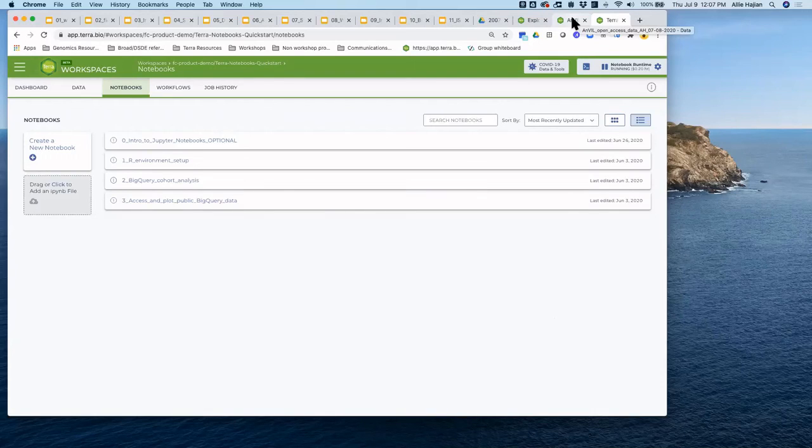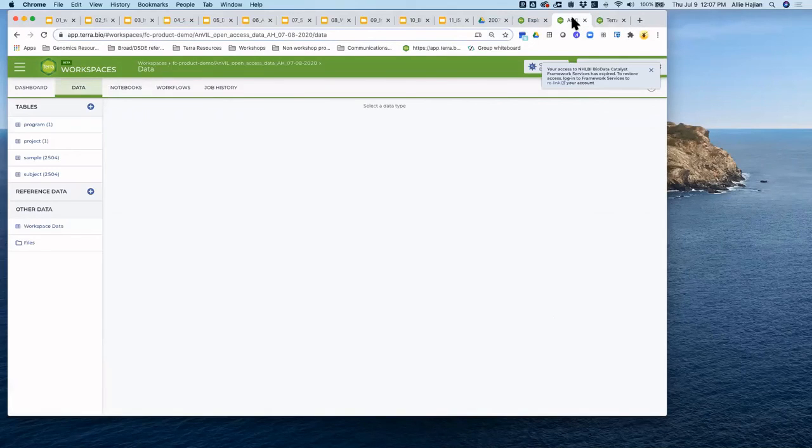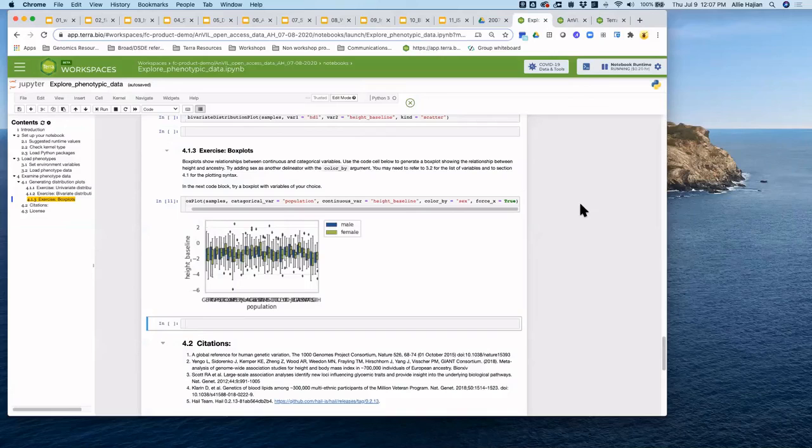Allie, just thinking about the notebook you just demoed, it did run the Terra Utils notebook at the same time as your other notebook was open. Oh, that's true. So perhaps if it's on the exact same runtime, if the notebooks have the same requirements, it's okay. If you had to run a Python notebook and then an R notebook that had 2 different environments, I'm not sure you could do that. I think you would get a warning about your runtime not being the appropriate one. You're right, Liz.